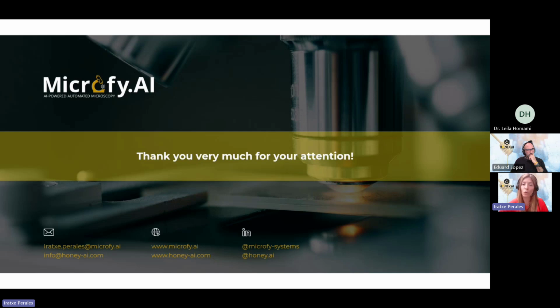Also for the new species that they trained for cedar honey, the accuracy is very good. Of course, for those species that we have not yet trained, the accuracy is not so good. So we have not done yet, for instance, a validation with honey coming from Sweden, because we know that we still lack some species from there. So it would not make sense for us to do an accuracy validation.